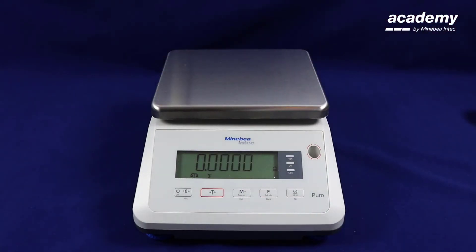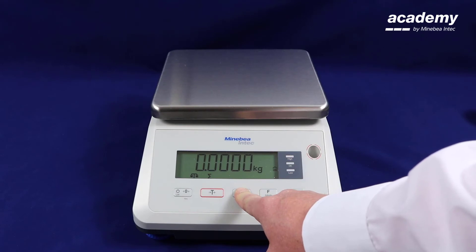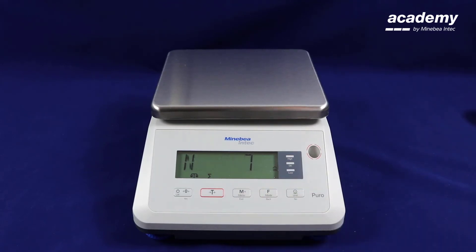When you have completed your weighings and want to retrieve your results, make sure the weigh pan is empty and press the M plus key. This will show you the total number of weighings, your total weight, the minimum weight, and the maximum weight of your samples.